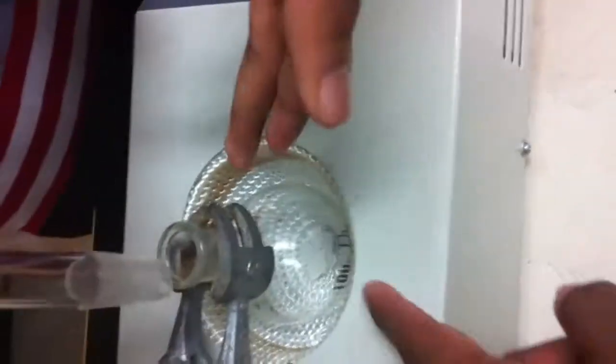Esters practice. What's this? This is a condenser. Here is a pipe that's letting the water out, and this is the water coming in to the condenser. This is a heating mantle. You turn on the power and it heats up this really fast.